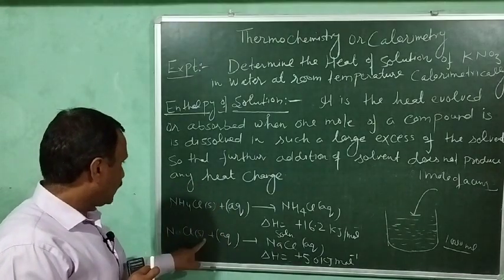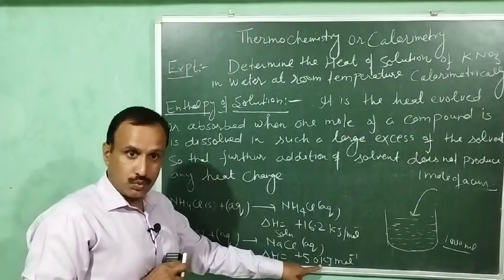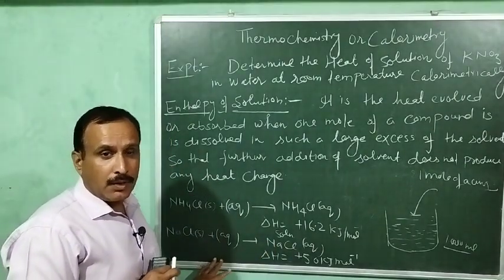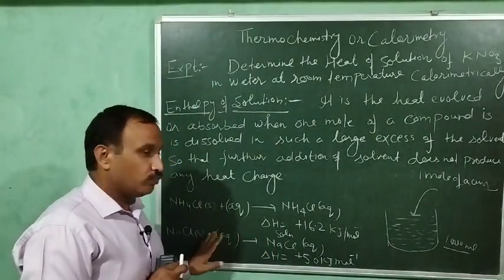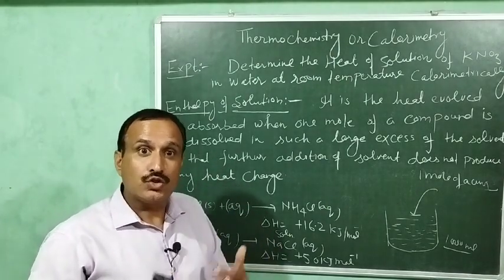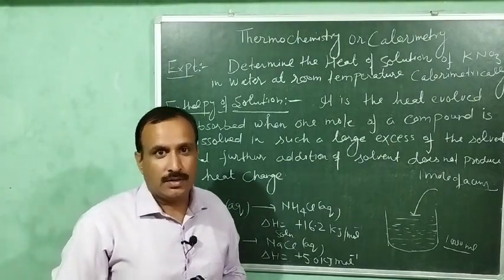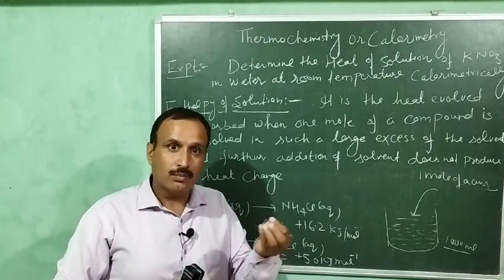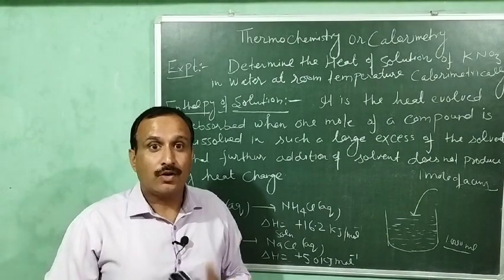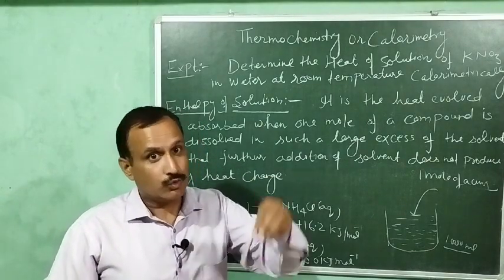And similarly, the enthalpy of solution of sodium chloride is plus 5.0 kilojoule per mole, and its dissolution is also endothermic. But it doesn't mean that every compound dissolves with the absorption of heat. There are some compounds which dissolve with the evolution of heat. An example is sodium hydroxide. When we dissolve 1 mole of sodium hydroxide in water, heat is liberated, and you will find that the temperature of the water will increase after the dissolution of sodium hydroxide.